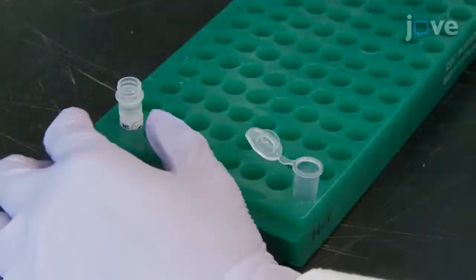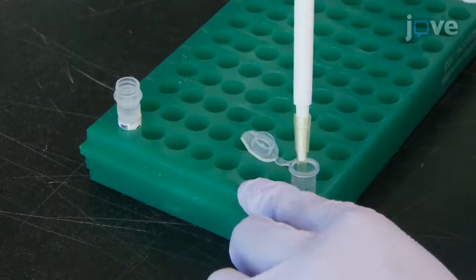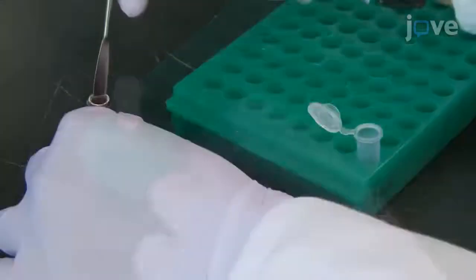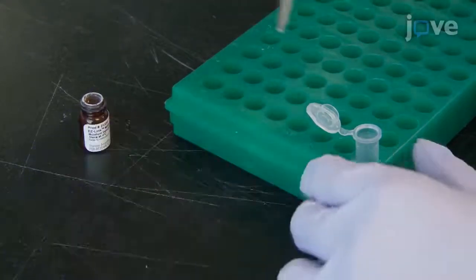While the Jurkat cells are in the centrifuge, aliquot 10 µL of DMSO into a new microcentrifuge tube. Next, dissolve a minimal amount of NHS biotin in the DMSO.